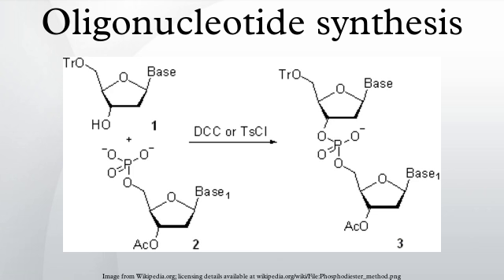The simplest to implement and hence the most widely accepted is the strategy where the exocyclic amino groups bear a base-labile protection. Most often, two protection schemes are used. In the first, the standard and more robust scheme, Bz protection is used for A, dA, C, and dC, while G and dG are protected with the isobutyryl group. More recently, the Ac group is often used to protect C and dC as shown in the figure.